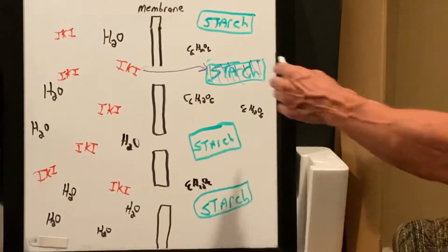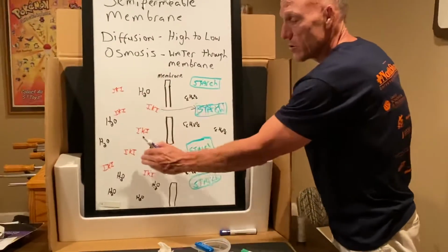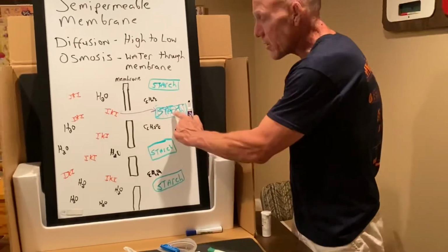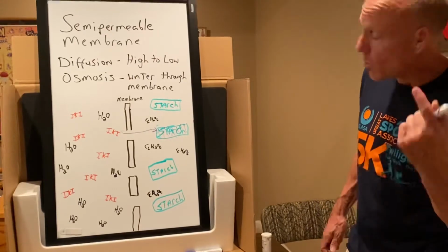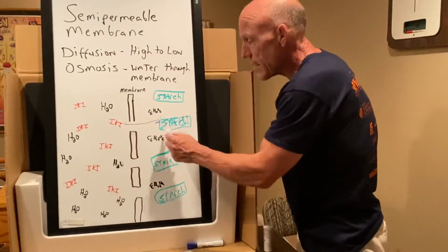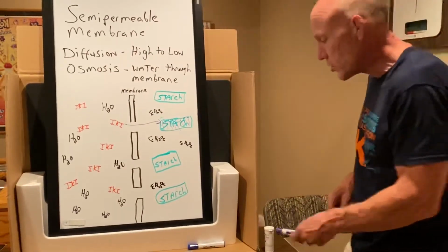And we'll know if the starch got out because the beaker then, the solution around the dialysis tubing, would be dark purple. I don't think the starch is going to be able to get through those pores. I think it's too big. Remember, large and charged. We'll see about the glucose molecules. How do we know about the glucose?